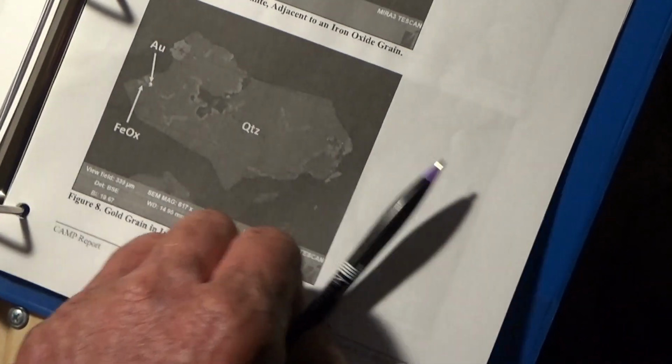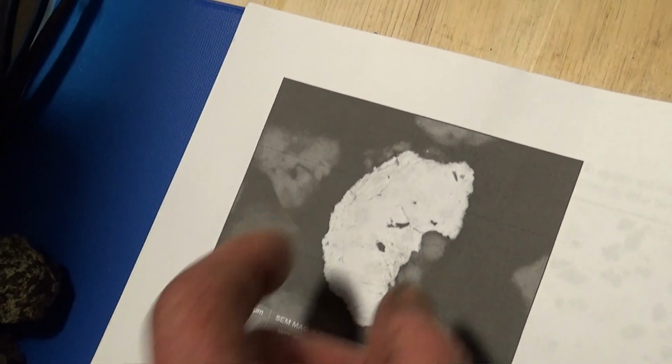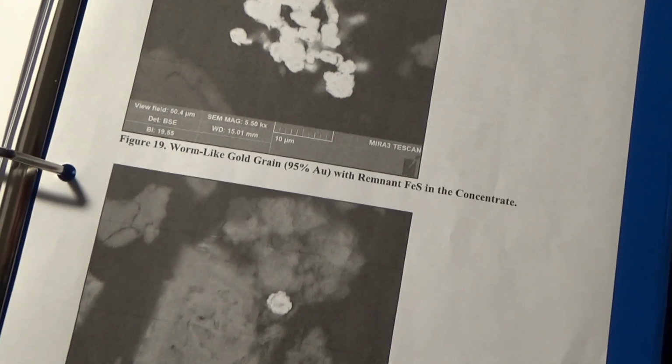Again, it's amazing the resolution that this gives. And to give you an idea, this is a single gold particle, and that's about 20 microns, and yet you can see pretty good surface detail in it. And here's various other gold particles.